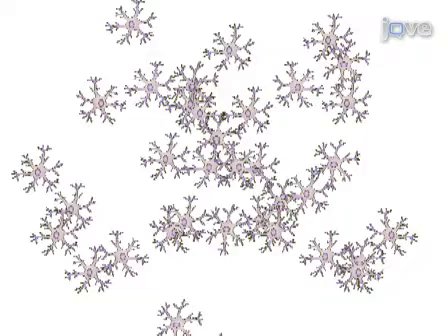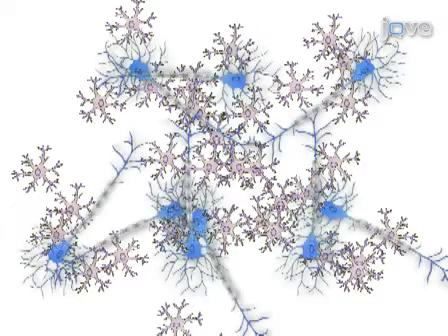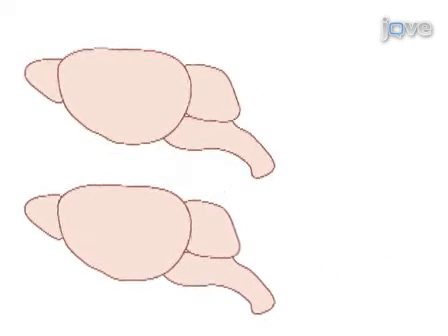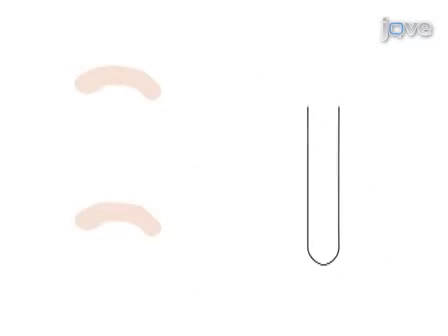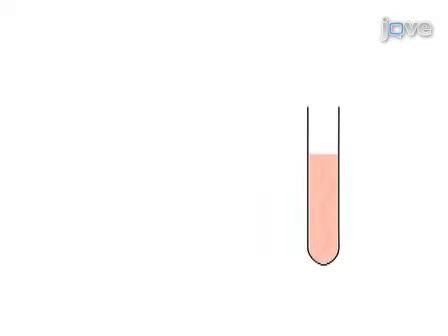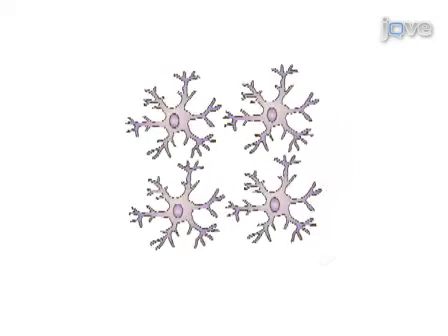In the first part of this video, we will demonstrate how to prepare the astrocyte neuron co-culture. To do this, several hippocampi from P1 rats are collected into a tube, digested with papain, and dissociated by trituration.